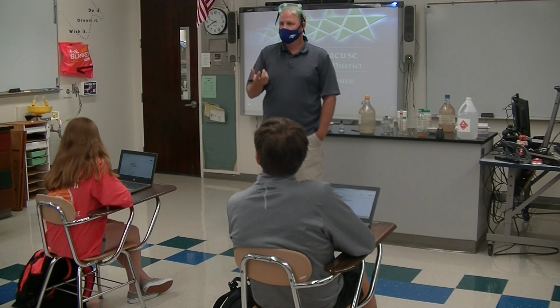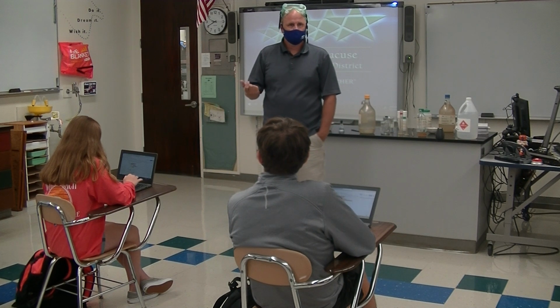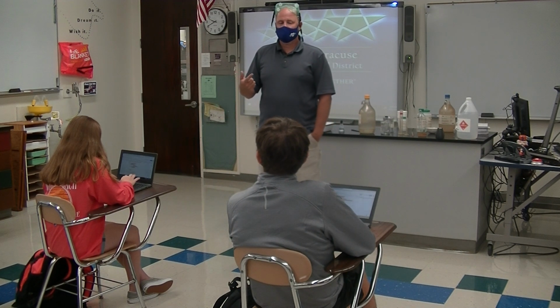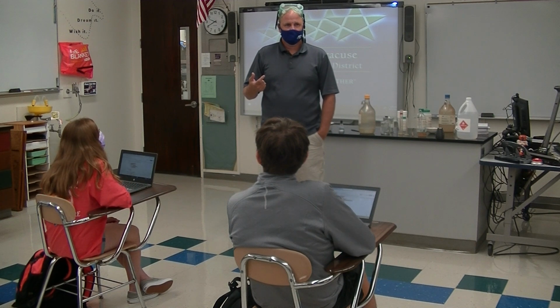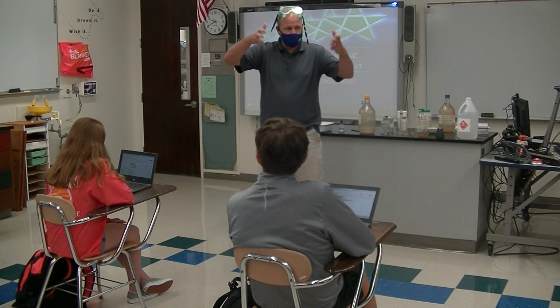What do you think is the standard for rinsing your eyes out with water to get something in your eyes, like a chemical? What would be a reasonable amount of time? 30 seconds? 15 minutes. So you have to hold your head under that water with your eyes open for 15 minutes.